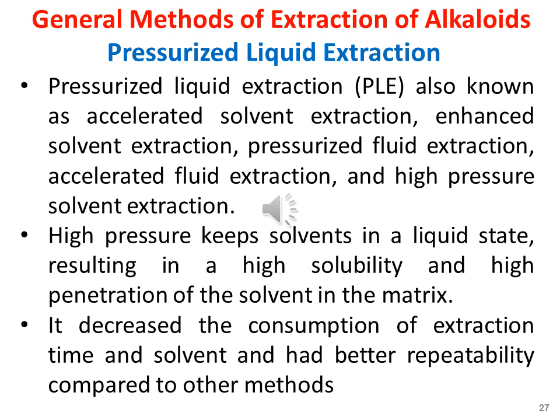Pressurized liquid extraction has also been described or known as accelerated solvent extraction, enhanced solvent extraction, pressurized fluid extraction, accelerated fluid extraction, and high pressure solvent extraction by different research groups. PLE, or pressurized liquid extraction, applies high pressure in extraction.